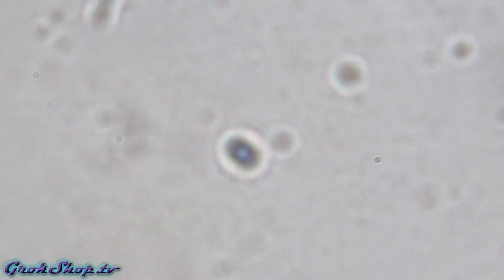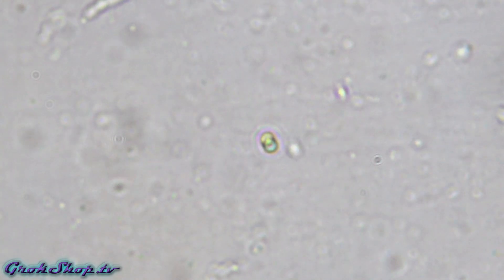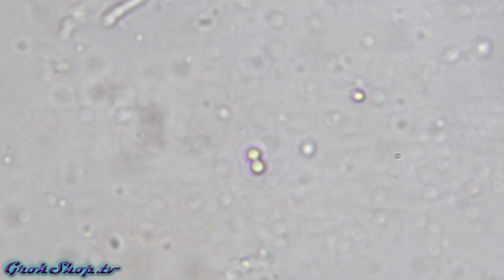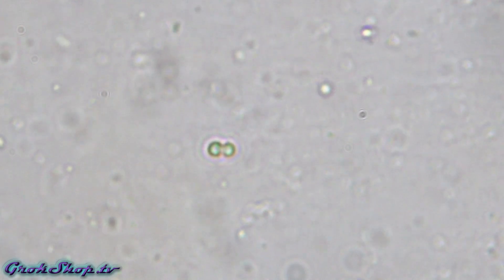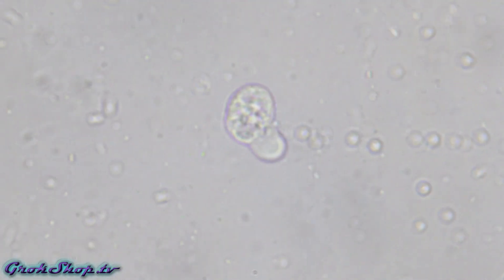I've got some nice binary fission going on here — cell division, mitosis, all these types of things happening. And I can see a little more fungal hyphae here attached to some organic matter.